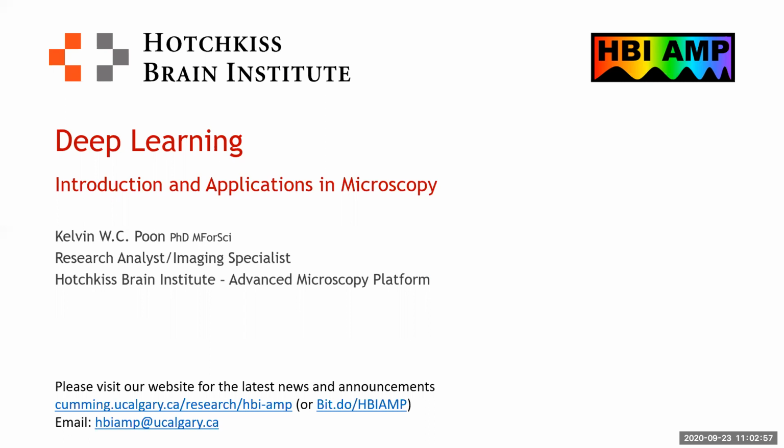I mean, we started off with the basics of how image formation starts, how do we even get a good image, and following on from that, basic image analysis, how to get levels and clean up your images and then counting, and then co-localization. Then the last one was machine learning, and then this is what we're going to end up with. And this is definitely going to be a beginner's crash course.